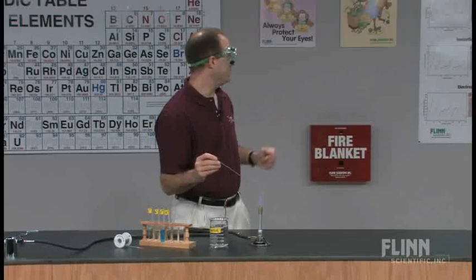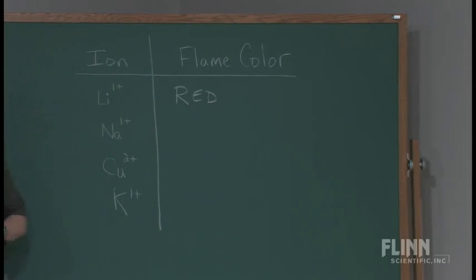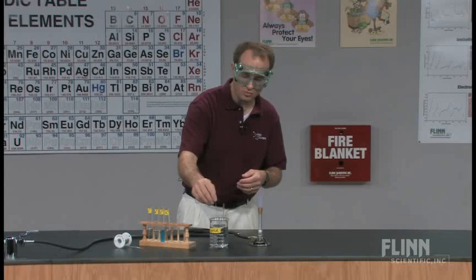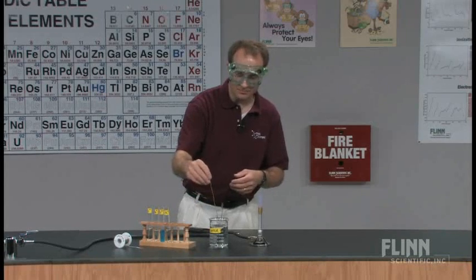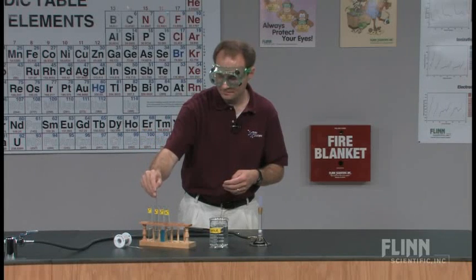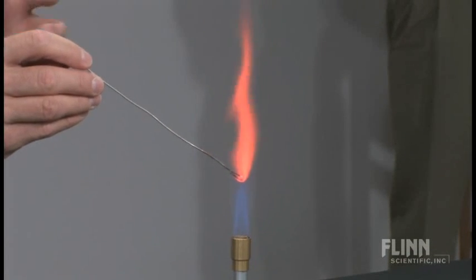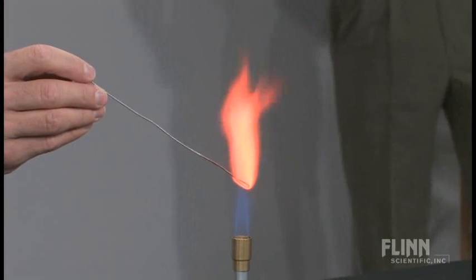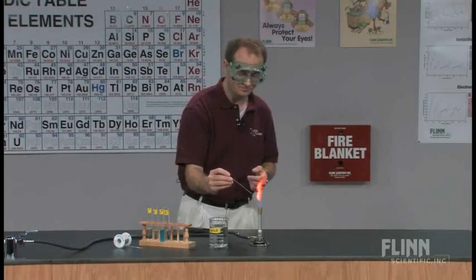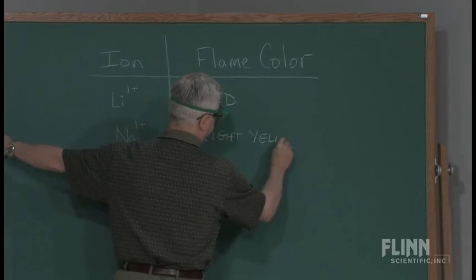What I'm seeing is that characteristic lithium color — we see that to be a red color. So write down red for the flame color of lithium. Now, there is still some residual lithium on the nichrome wire, so I'm going to rinse that in the beaker of water before going on to the sodium. And there we see the bright yellow-orange color of a typical sodium flame — a yellowish-orange or bright orange.